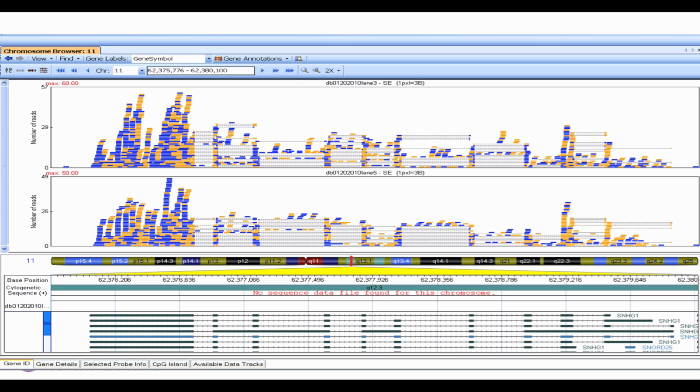So sometimes the statistics can emphasize changes that are not biologically meaningful, and this is a little bit of a reality test to see if it means something when you look at the actual data. And so it's very nice to visualize your data for some of the genes, as many as you have patience for.